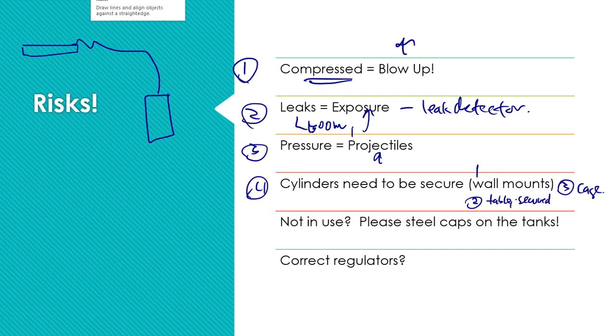So a couple of different options here to securing these tanks so that way they're not going to turn over and themselves become projectiles where they're going to zoom across the room and knock out a wall or knock out a few people in the middle of it.